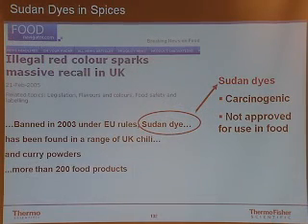So the melamine story is well known, and it's an example of a non-targeted compound. Now, this morning you heard John Gilbert talk about Sudan dyes, and of course Sudan dyes have been around quite a while, but as he pointed out, some of the Sudan dyes may be carcinogenic. They are not approved for use in foods.